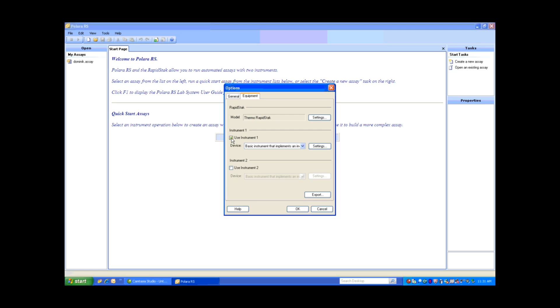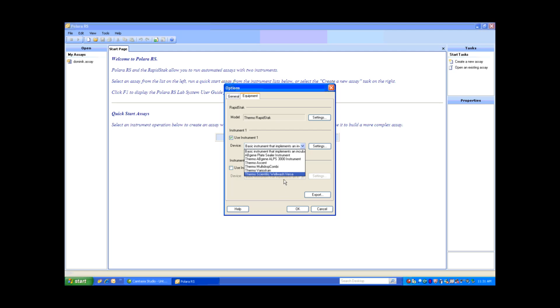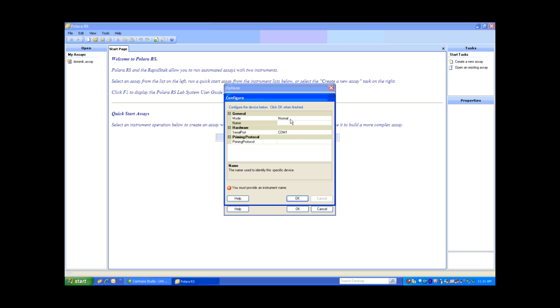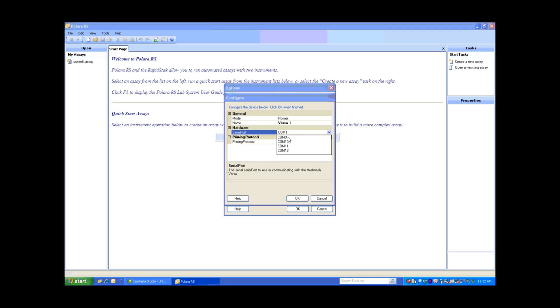Next I'm going to select one instrument. I'll bring down the tab, which shows all the instruments available for use in my system. Today I'm going to select the WellWash Versa. For the settings, I'm going to be in the Normal setting because I'm connected to a Versa. I'm going to give my Versa a name — I'll call it Versa 1 — and identify the Comport. I know this Versa is on Comport 10, and I'm going to select OK.